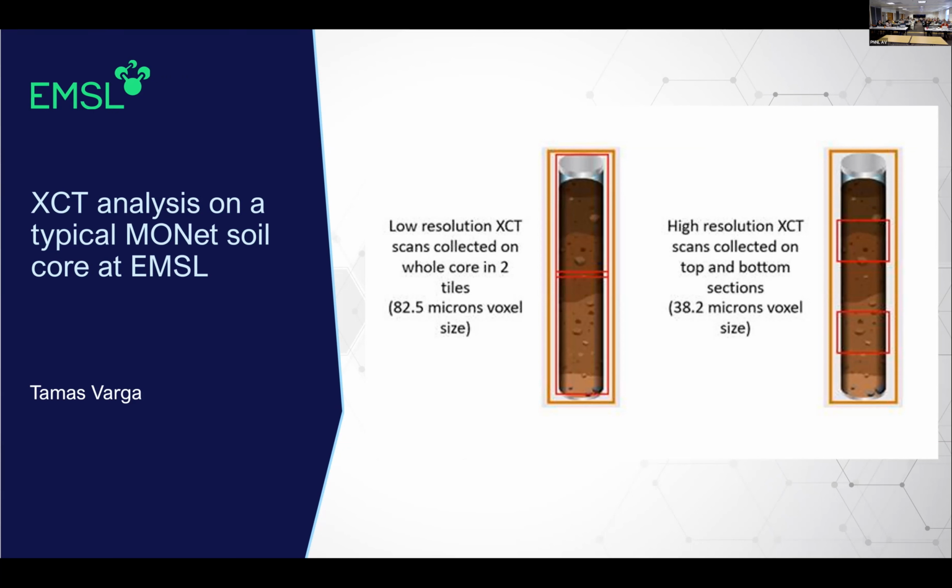But yeah, the 3-inch relates to the fact that we zoom in on the core so that we include the full width. And for the 3-inch core, that's 3 inches, so you get this kind of a volume. Is 38 microns the smallest size that you would ever want, or do you ever want to go smaller than that? Like, are there soil structures at sub-micron scale?